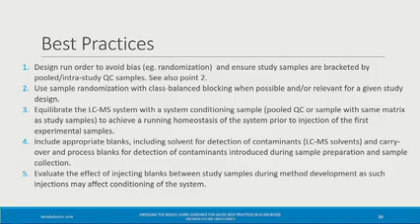And I think this will be our last question right here. I have a short comment on the blanks. I think they are really important, and when you show it in the sequence, you have one blank and then 3 QCs, and at the end of the sequence, 3 QCs and 1 blank. I think it probably should be balanced: 3 blanks, 3 QCs, just to really know what is in your blank.